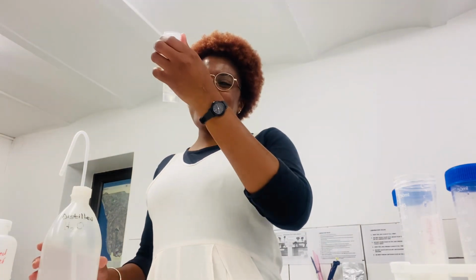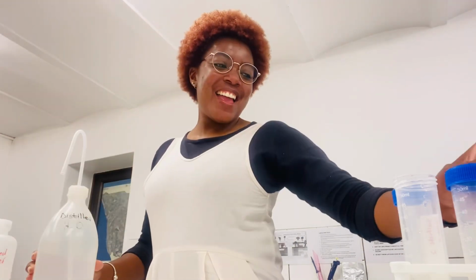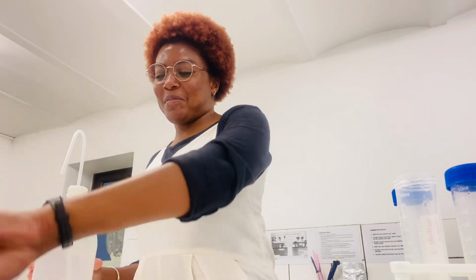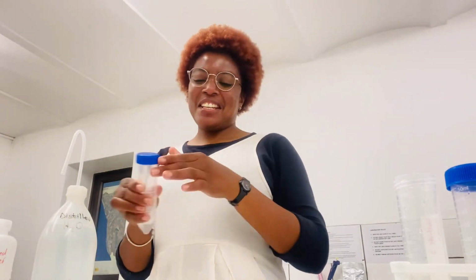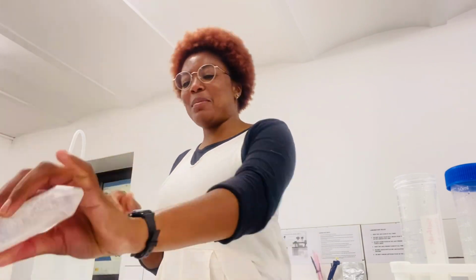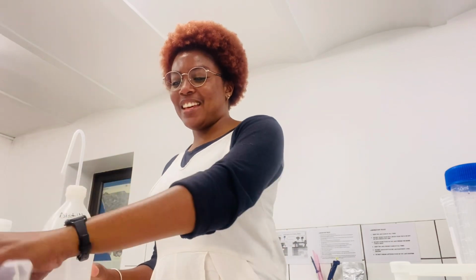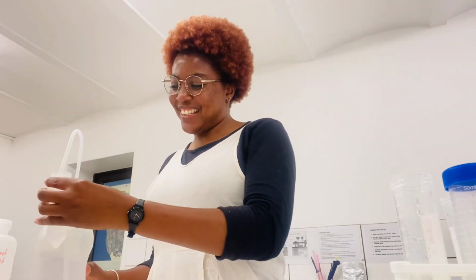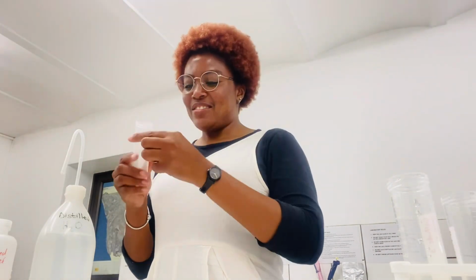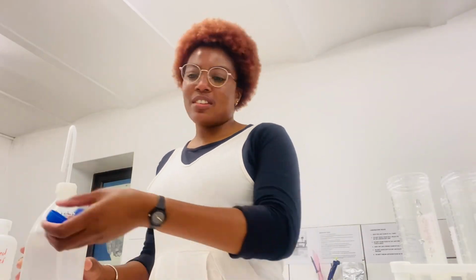With the naked eye it looks nice and transparent, but then in the microscope, there's all this debris, all this phytoplankton stuff. You would even see with the pictures that some of them are even in chains. You feel like if I drink this, it can even get stuck in my throat.